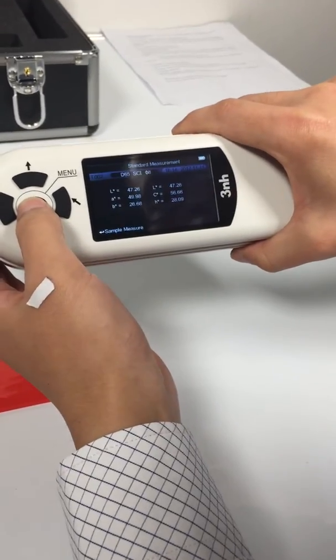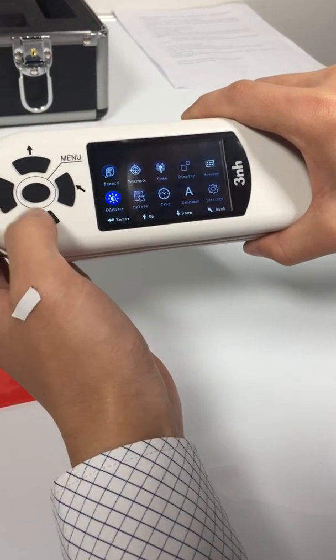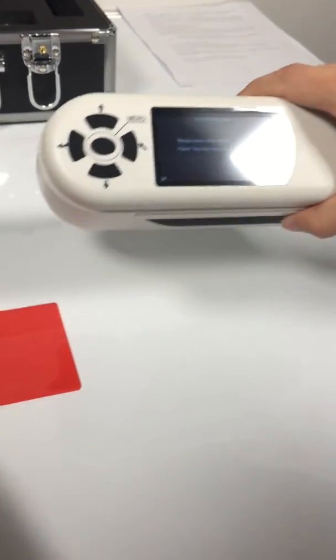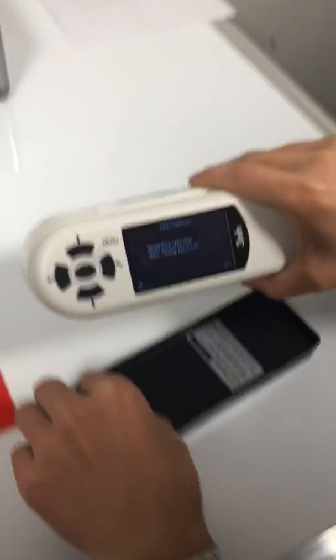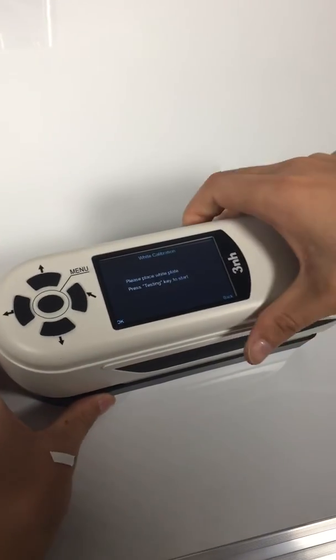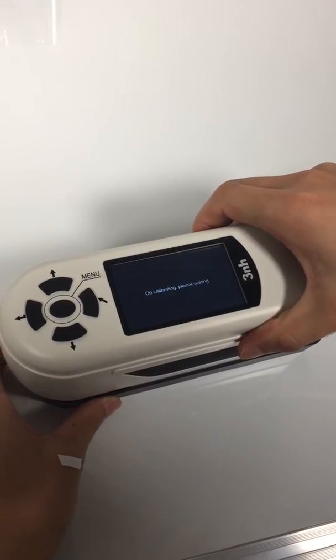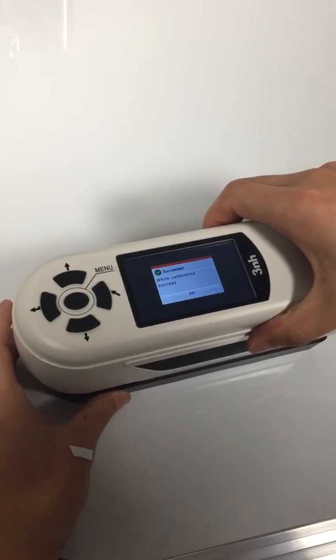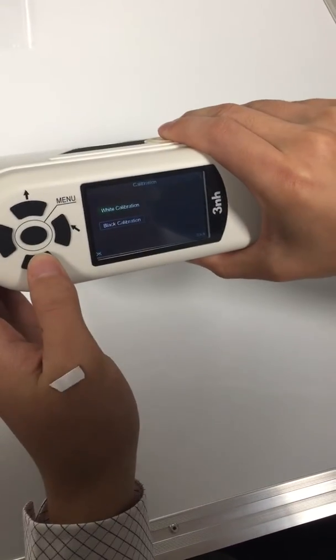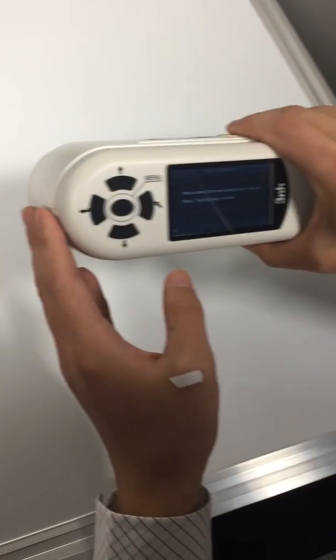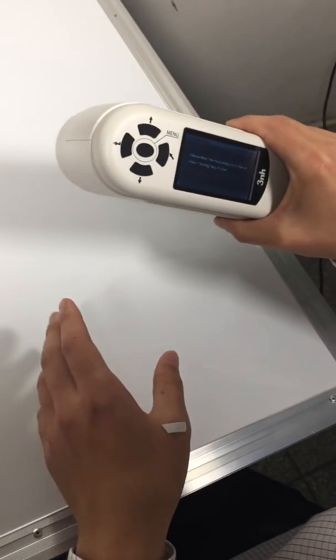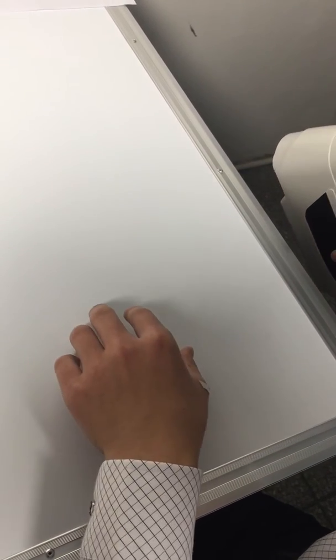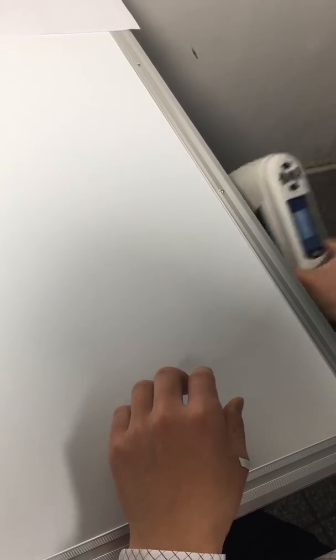First we do white calibration. And then black calibration. For black calibration, we do it in a dark space, like under the desk. It's done.